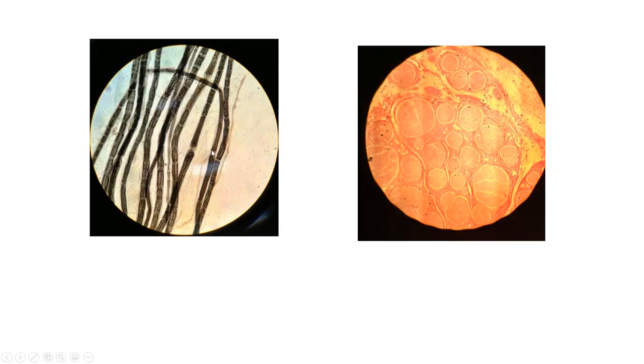We come here, and this is a microscope slide of axons of neurons. What you're looking at here, that light spot right there, and you can see one here too, those are nodes of Ranvier on axons. You can see that it looks like little sections here. Those light spots would be the nodes of Ranvier. So these would be myelinated axons. And then this is just showing you cross sections of a peripheral nerve. Remember, a nerve is made up of a bunch of neurons. And so that's what you're seeing in here. So this entire thing would be a nerve, and you can see the little bundles, fascicles, of neurons inside it.